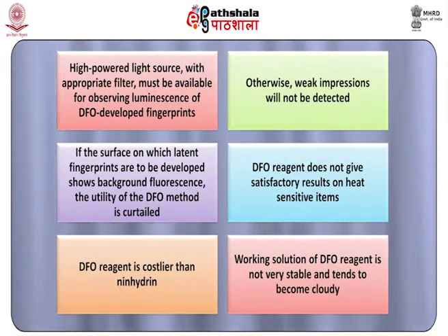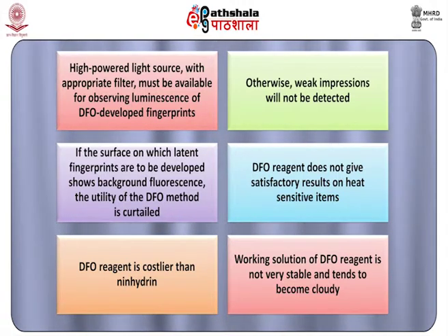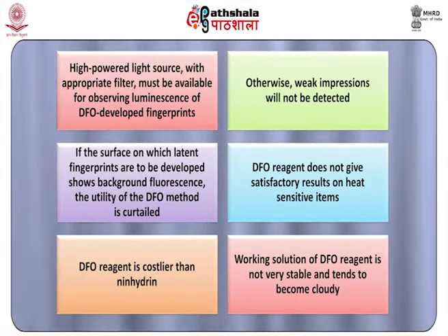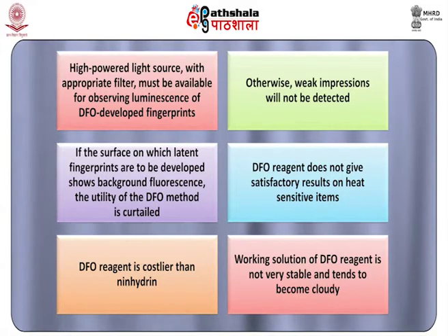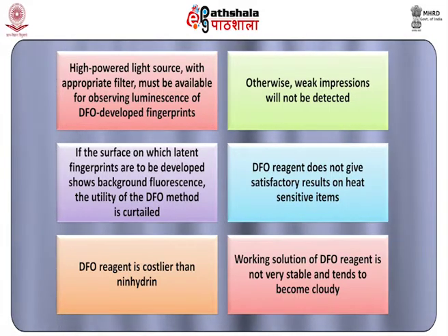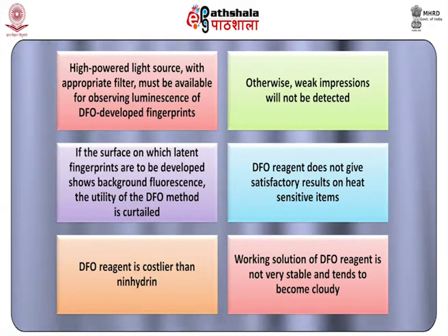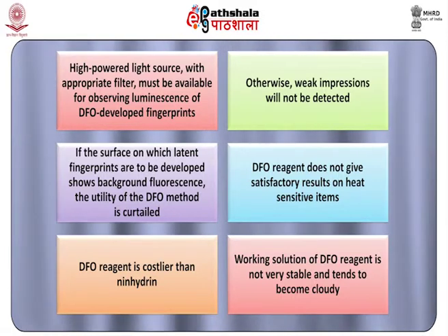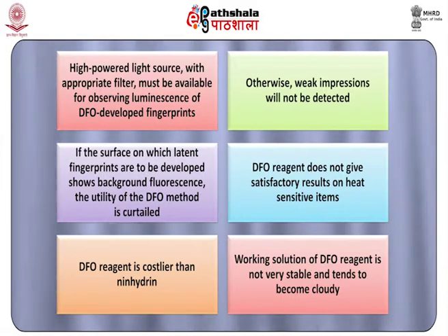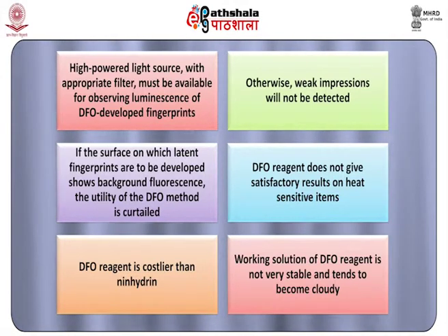The DFO method has the following demerits as compared to the Ninhydrin technique. Number 1. A high-powered light source with appropriate filter must be available for observing luminescence of DFO developed fingerprints. Otherwise, weak impressions will not be detected. Number 2. If the surface on which latent fingerprints are to be developed shows background fluorescence, the utility of the DFO method is curtailed.